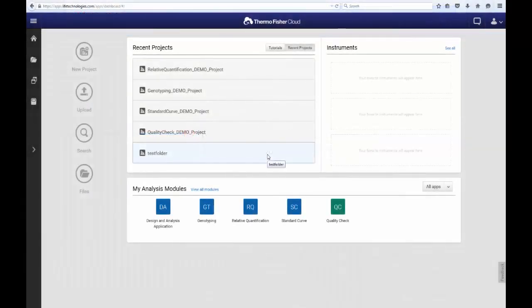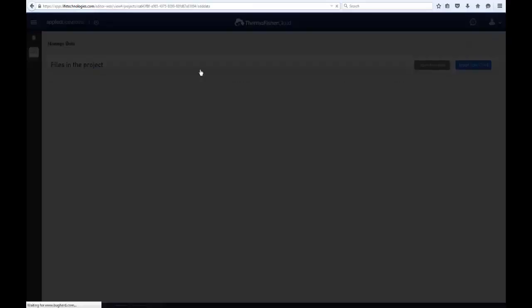This is the Thermo Fisher Cloud homepage, and from here you can create new projects and upload or import your experiment files to them. For this demonstration video, I will be using the built-in demo project for relative quantification.